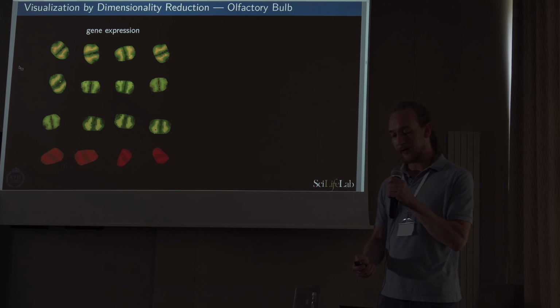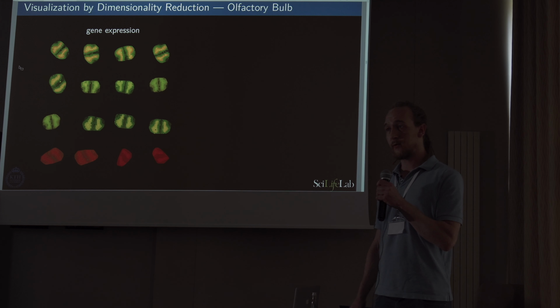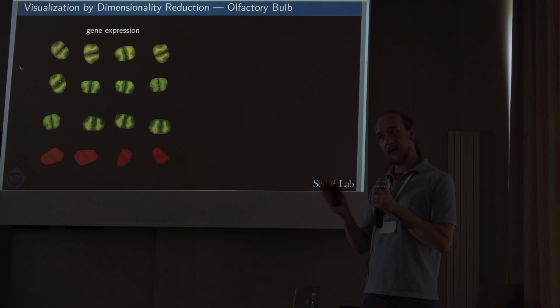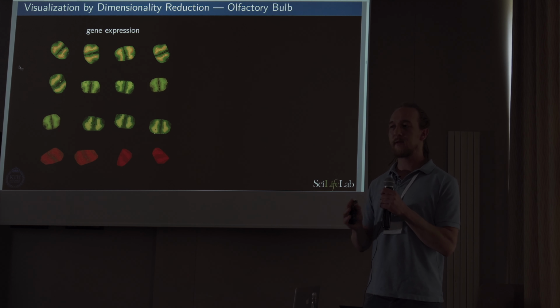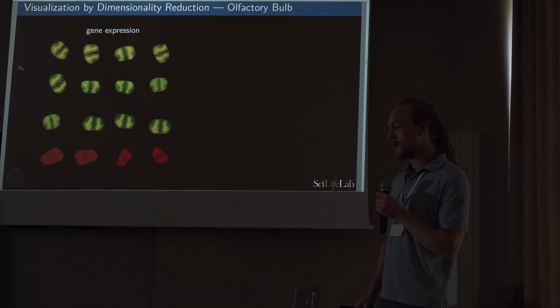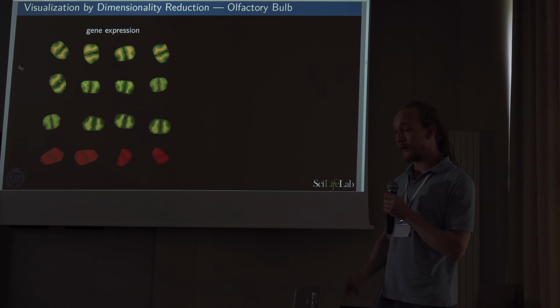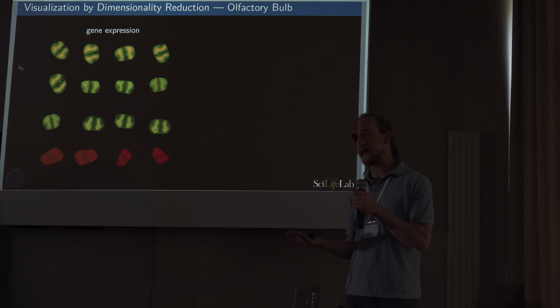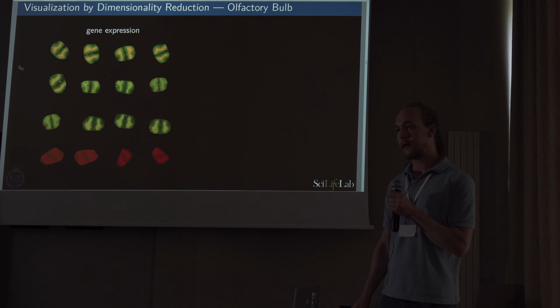Yeah, that's a good question. The batch effects is exactly what I wanted to get to now. As for the other point, I guess you're referring to positional effects on the arrays. Yes, such effects might be present. They would be more pronounced, presumably, towards the corners. And the tissue is typically placed towards the center, and we only consider those places, really. We haven't studied such positional effects sufficiently yet, but you could take subsequent sections and put them on multiple arrays in different orientations to address that.